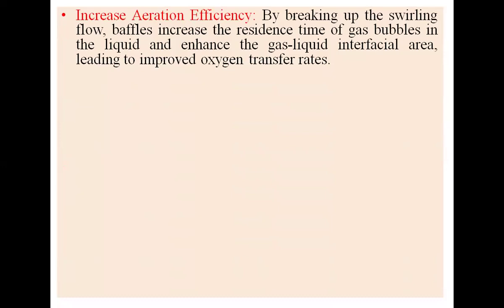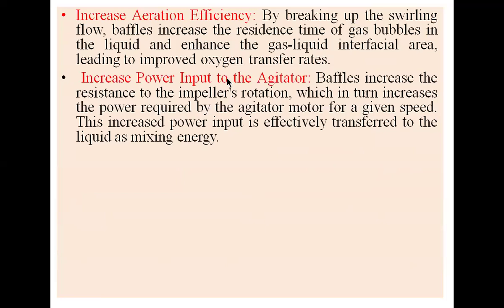All right. The next function is to increase aeration efficiency. By breaking up the swirling flow, baffles increase the residence time of gas bubbles in the liquid and enhance the gas-liquid interfacial area, which leads to improved oxygen transfer rates. Microorganisms very happily receive the nutrients, temperature, pH, and oxygen concentration, and we are able to get a good product.